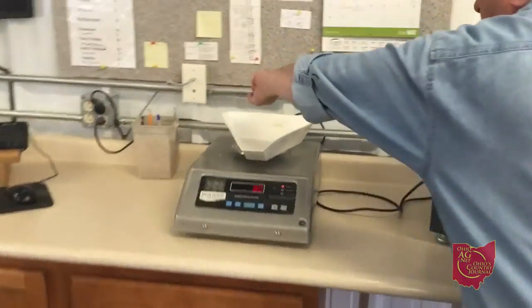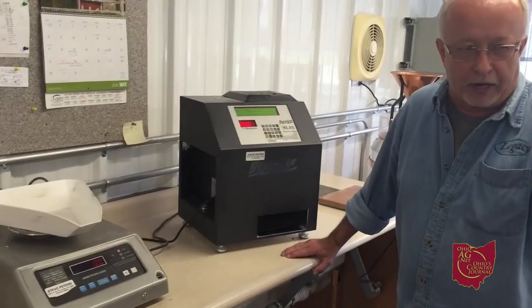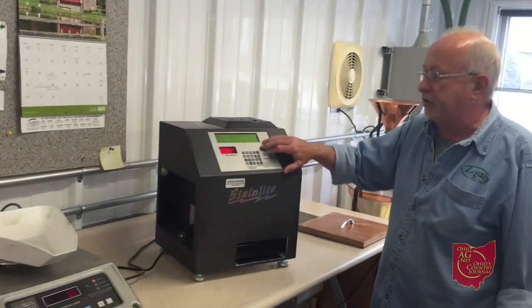The other pan you pour into here, hit memory, and then bring it over to the dockage tester right here. You turn that on and that gets your dockage, and this here gets your moisture.